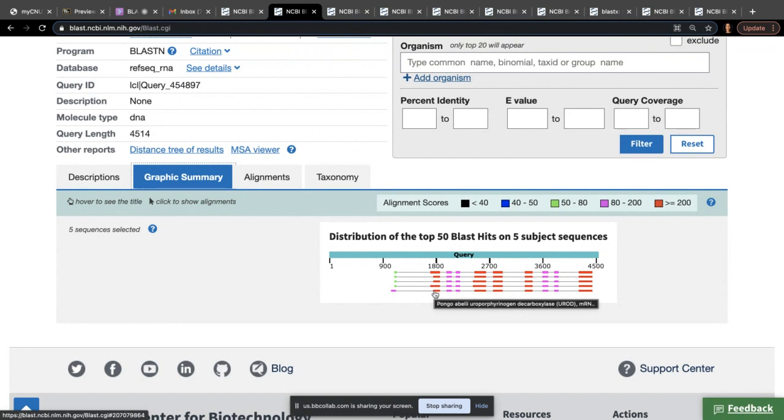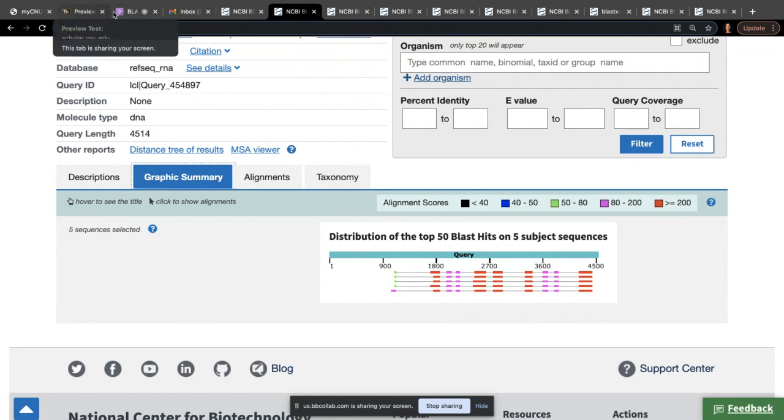Yeah, there you go. Oh, aren't you glad when stuff works? So there is only one gene predicted, and it's the same gene as we found when we did the BLASTN. And the parts that match to the mRNA are not the full sequence, but the answer is still, there is one gene that is predicted in that sequence that I entered as a query.